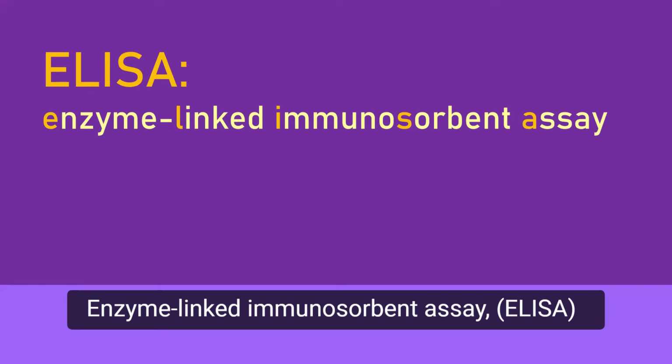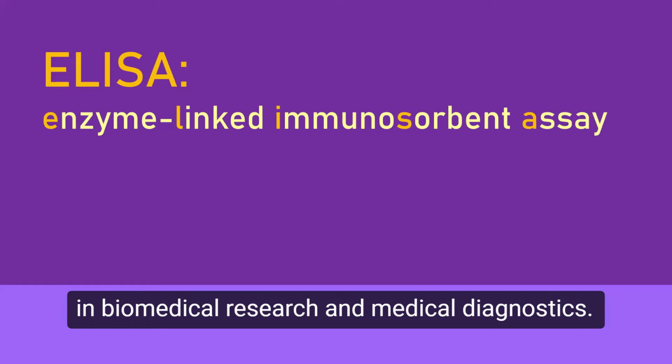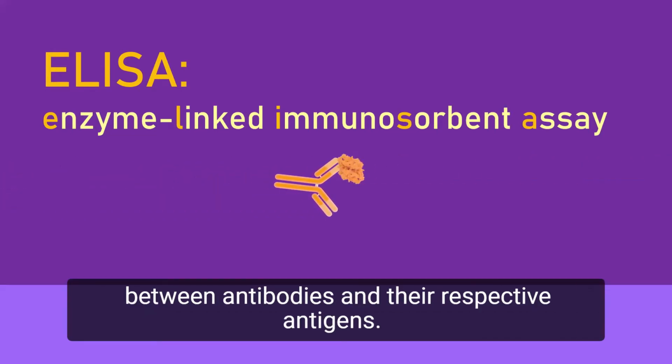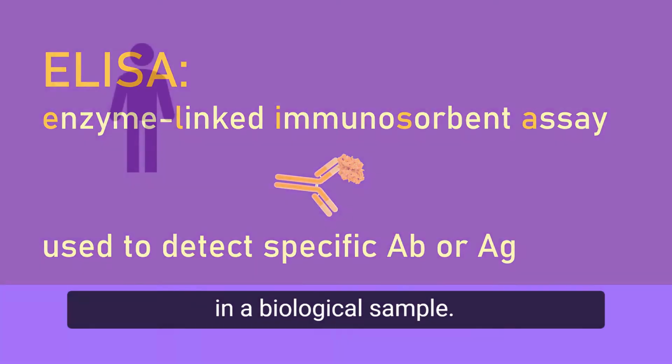Enzyme-linked immunosorbent assay, ELISA, is one of the most commonly used techniques in biomedical research and medical diagnostics. It harnesses the specific interaction between antibodies and their respective antigens. It can be used to detect a specific antibody or antigen in a biological sample.